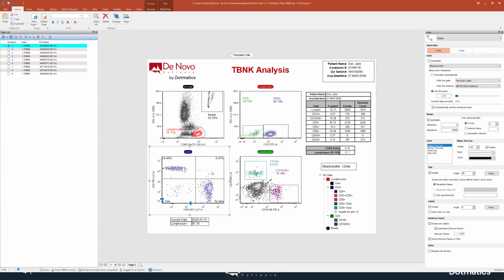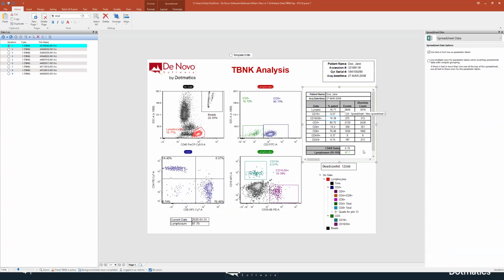Okay. The next thing I'll show you is exporting your internal spreadsheets via batch actions. So we actually have a spreadsheet here. It's hidden. I have the headers and grid lines turned off so that we can actually use it as a visual table here. But if I click into it, and I always like to show this because I think not a lot of people realize this.